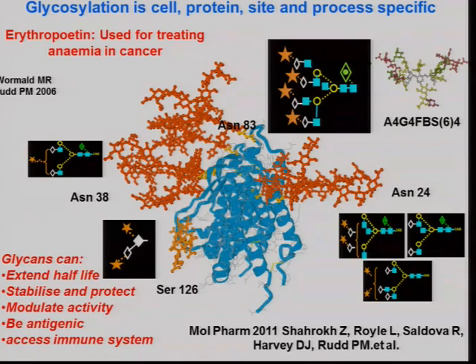I mean, where mass spectrometry is really powerful is when you want really detailed glycan analysis. So that tetra-antennary glycan there, if you didn't have sialic acid on one of those arms, I'll show you if I have time, you could find out which arm it was missing from with mass spectrometry. You couldn't do it with LC. So detailed glycan analysis needs very powerful mass spectrometry. So I would say people do use it.